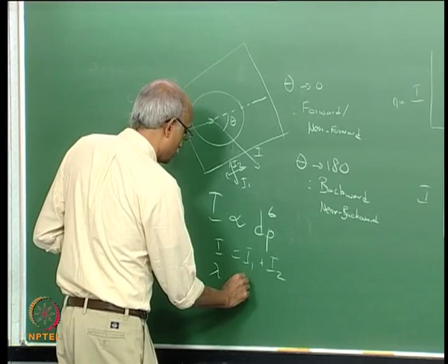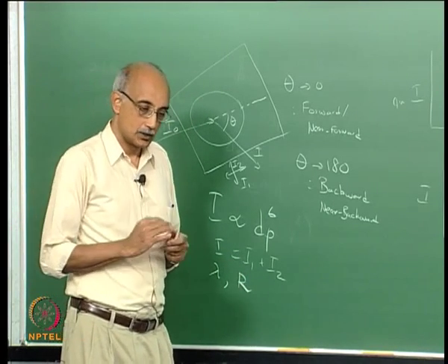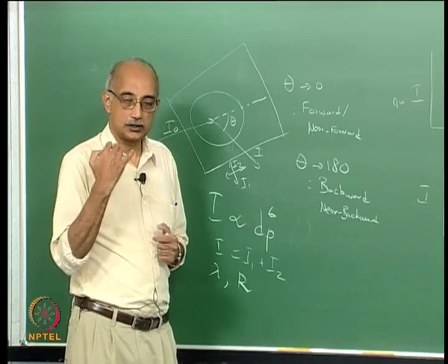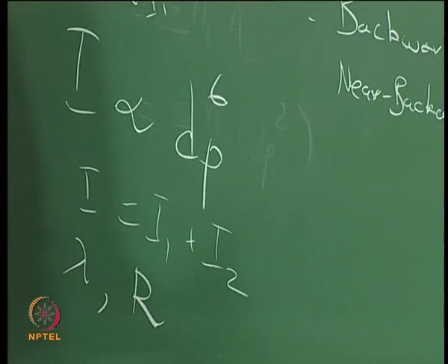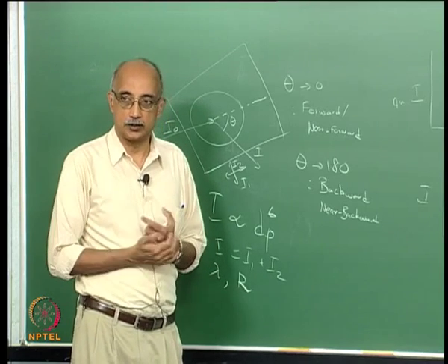The other one that will always be an important parameter is the distance between the observer and the object that is being analyzed. Now in this case, the observer may not be a person, it is actually your system instruments that are detecting the signal.